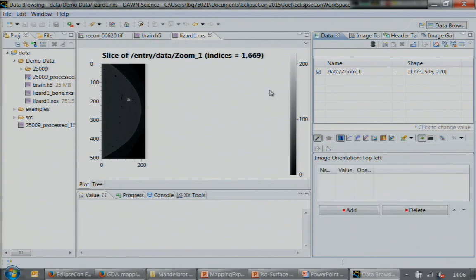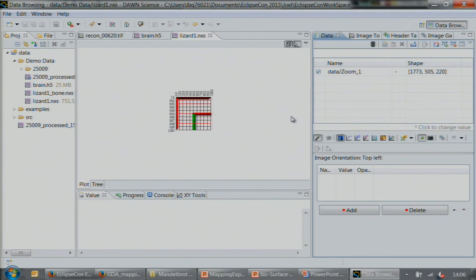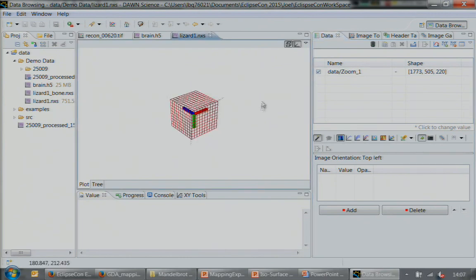But currently, this is quite hard to visualize in 2 dimensions, so the easiest way to do this is to create an Isosurface. Hopefully, it will run nice and smoothly, but for some reason, the laptop's being extremely slow. Sorry, guys. It was running perfectly smoothly yesterday. I think it's because it's plugged in, it's recording the data.